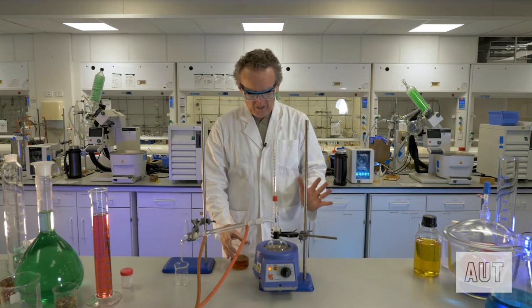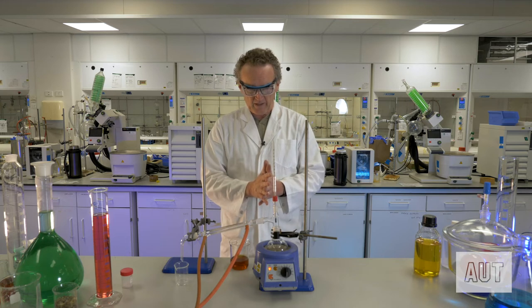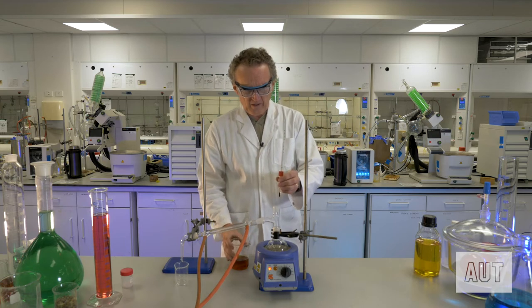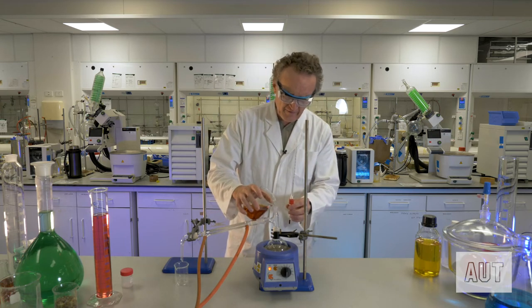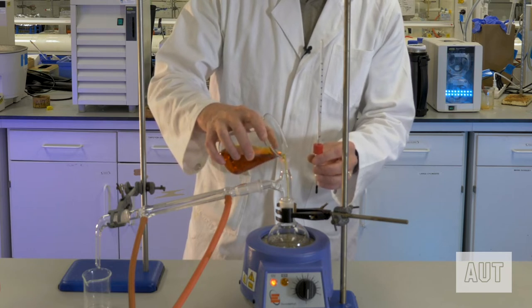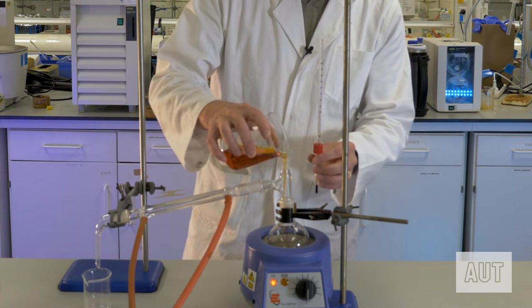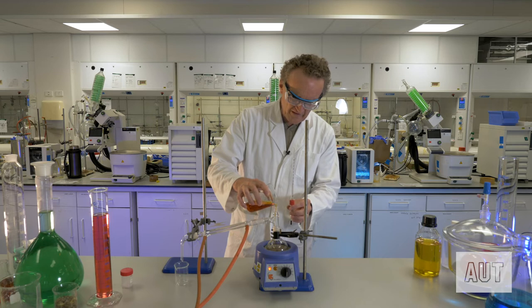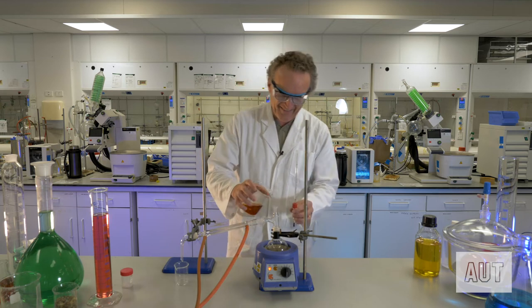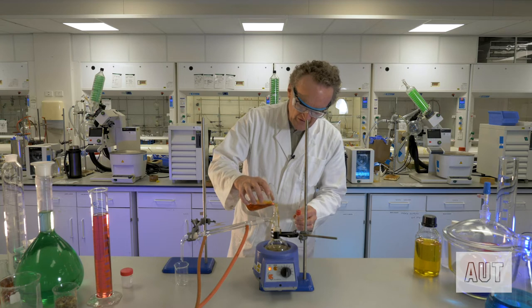So we're all set up to go. Always have a last double check of everything, make sure everything is set up correctly. And then what you do, probably best to just take that out and very, very carefully, you probably should use a funnel for this, but let's see how we go, you just pour in your liquid to be distilled into there, hopefully taking care not to pour it down the condenser because that will kind of defeat the whole purpose of the exercise. So we'll just pour a little bit more in. We should be all good.